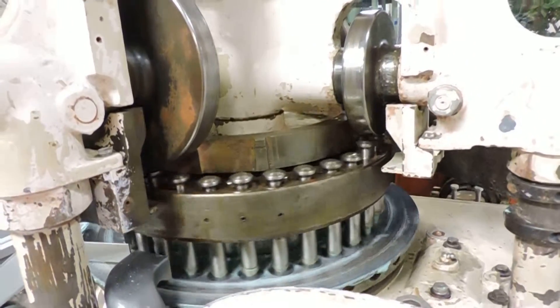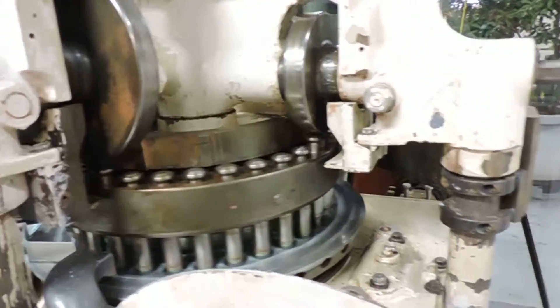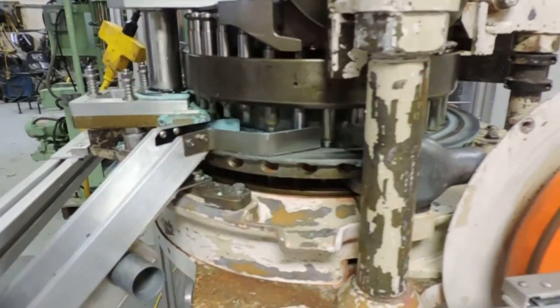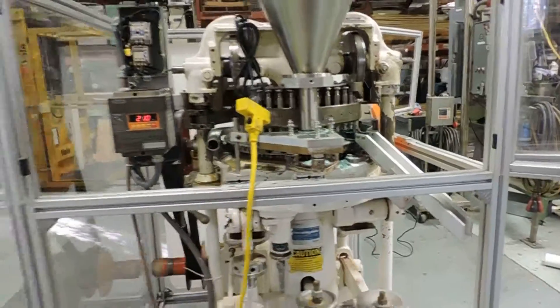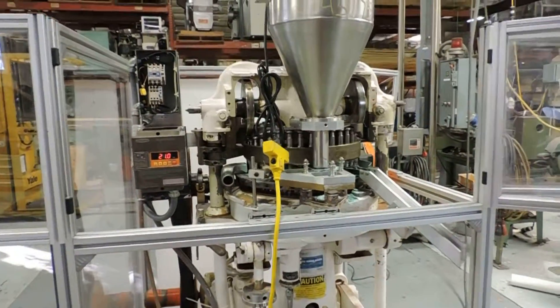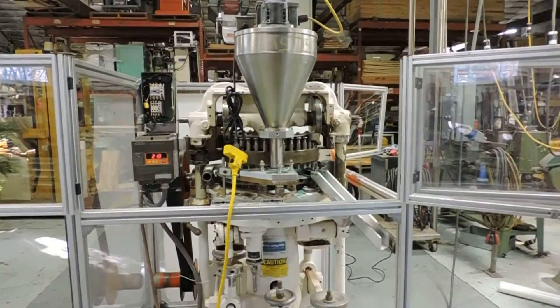It runs very smoothly. There's a variable speed agitator for the hopper up top. All the standard features of most of the Stokes presses. You can see this on our website at www.champtrading.com under our presses tablet section. We look forward to hearing from you.